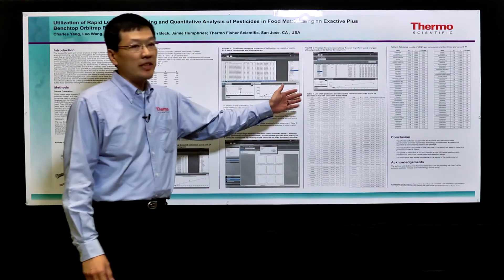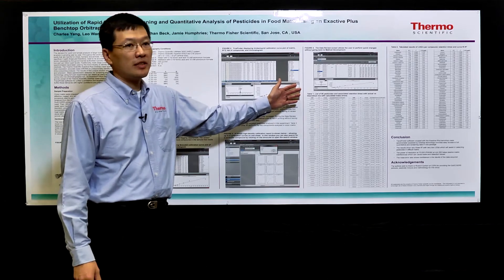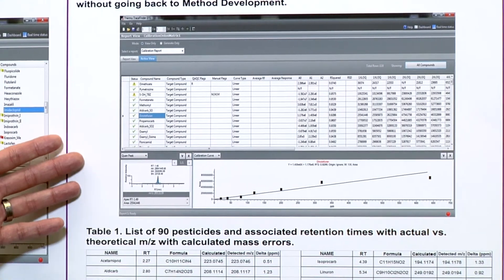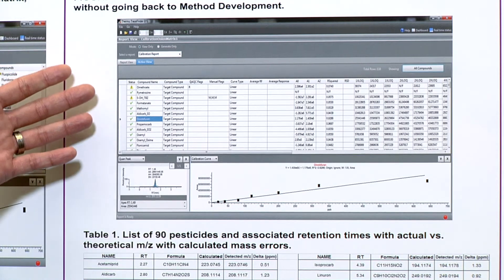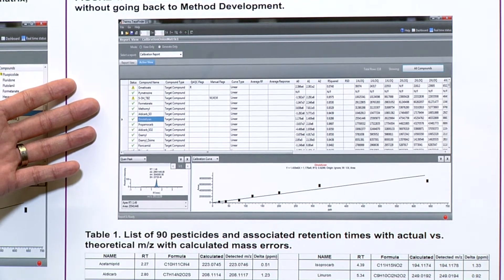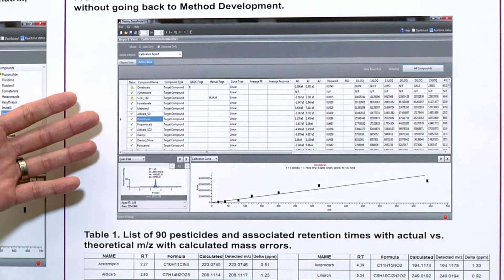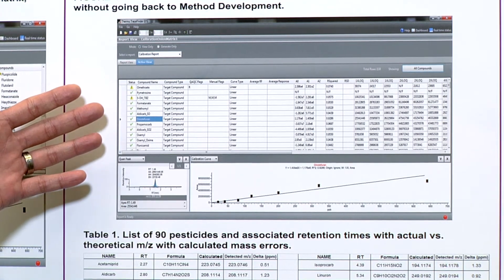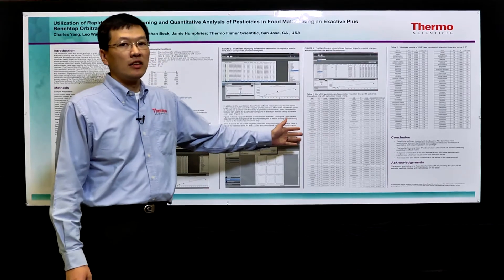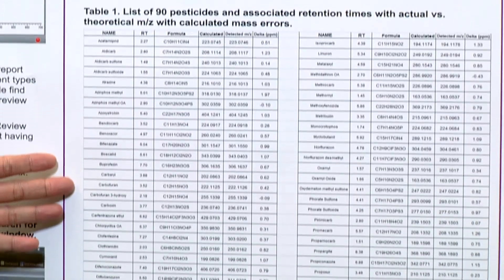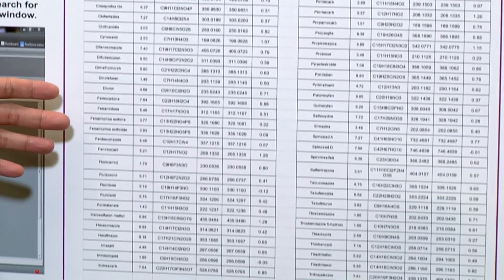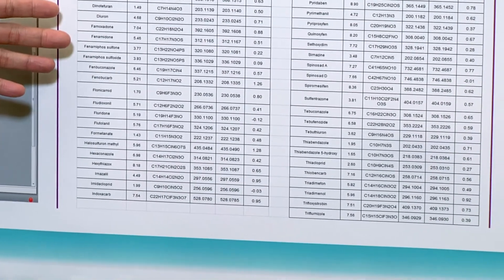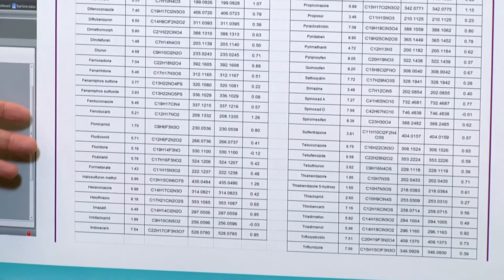Over here we have a special data review area where we can look at all the data and adjust parameters prior to printing the report. Once this is done, you have a quick way of reviewing everything. Down here are the mass accuracies of the 90 pesticides we analyzed — all within less than 2 ppm throughout the whole run.